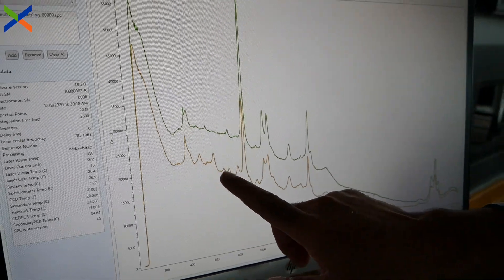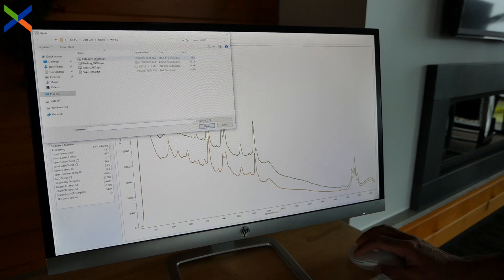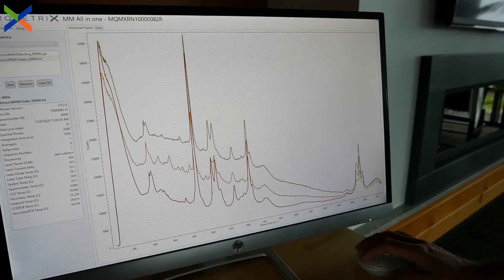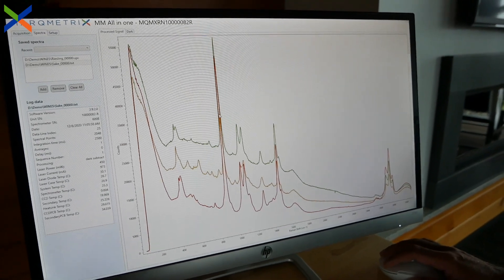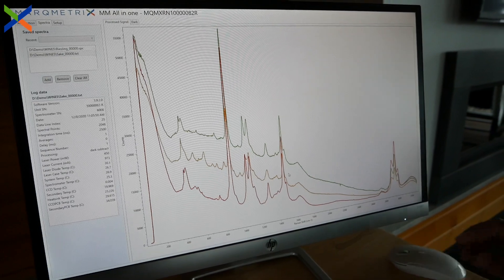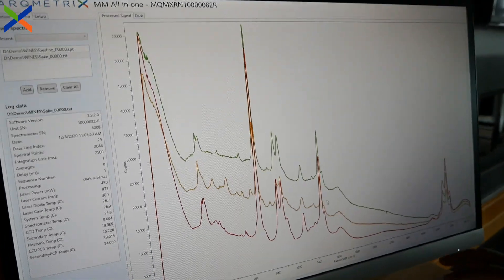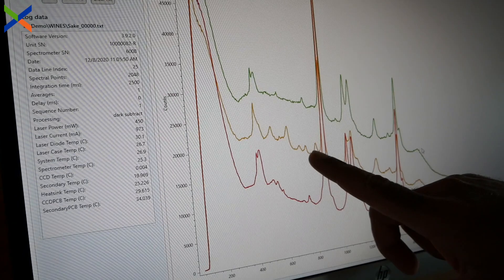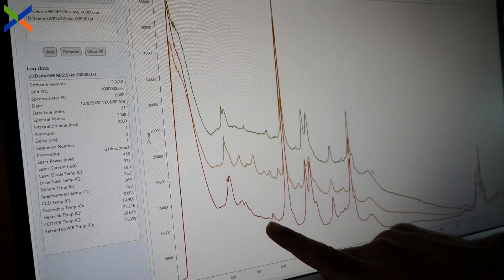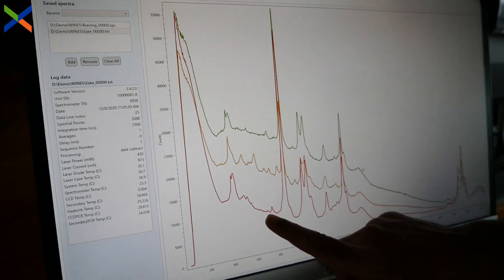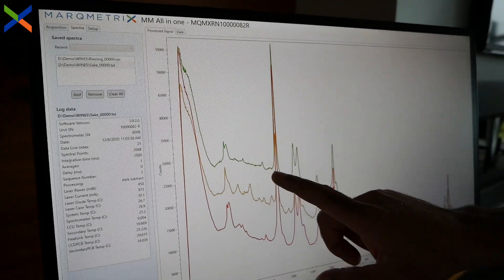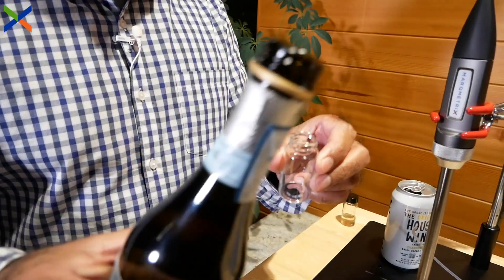Let's also add our driest wine, the sake. So the Riesling has the lower alcohol peak but also has the highest amount of sugars — the peaks for the sugars are in that region right there — and there are no peaks in that region for the sake, and no peaks in that region for the rosé.